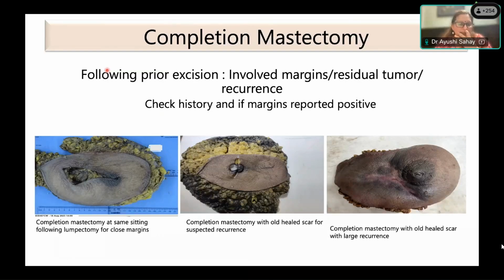Now, completion mastectomy is the most common specimen that I have seen that gets grossed inaccurately. So I would like to tell what the different types of completion mastectomies you can get are.